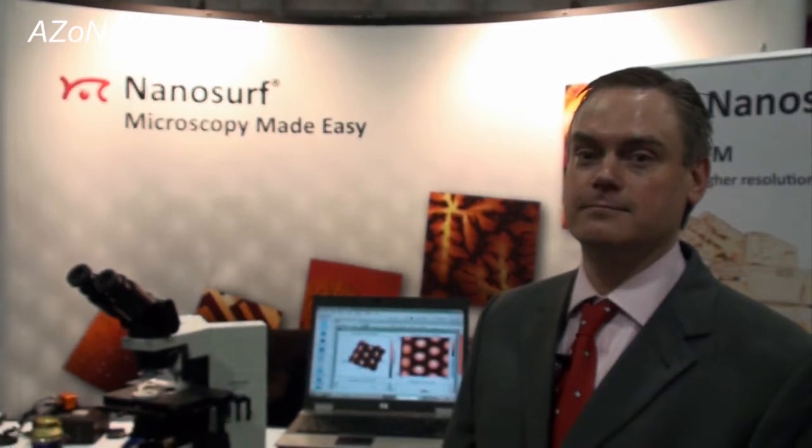This is Cameron Chai from AzoNano, bringing you another episode of AzoNano.com TV. Today I'm speaking to David Faddis from Nanosurf, who's going to show us through their Lens AFM system.